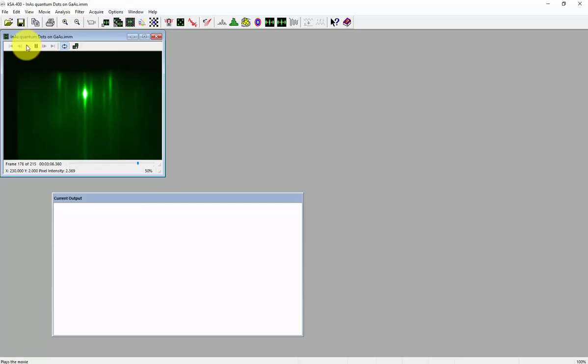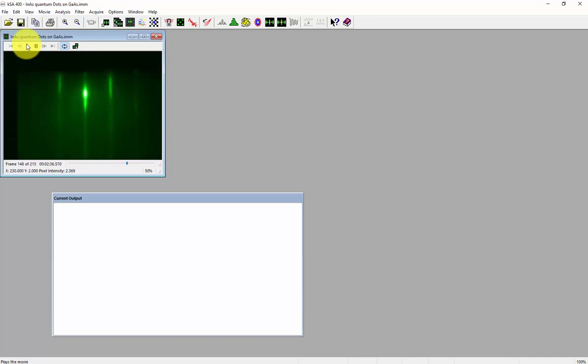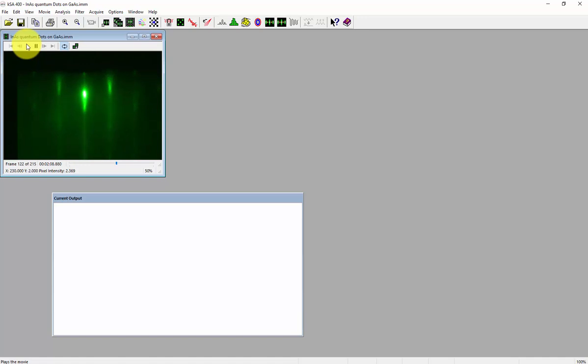One feature that KSA customers appreciate is the ability to export images from a movie file or a .imm file. Here is a demonstration of how to do that.